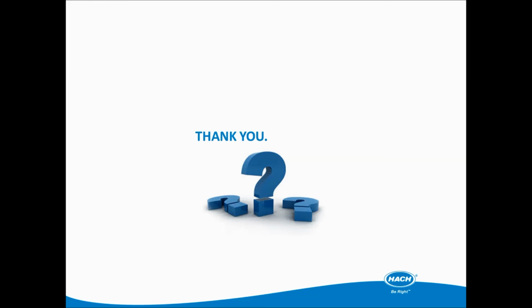Okay. On to another question we've got here. So, is the online monitor only measuring the soluble P, whereas the P consent is on total P? How can this be dealt with? Yeah, when we are measuring in the feed forward on the inlet, then we are measuring orthophosphorus, and as we mentioned at the start, a lot of the load is in the orthophosphorus state.